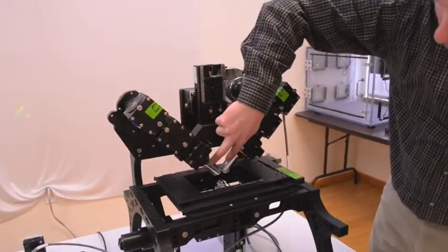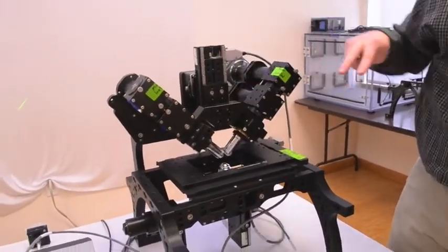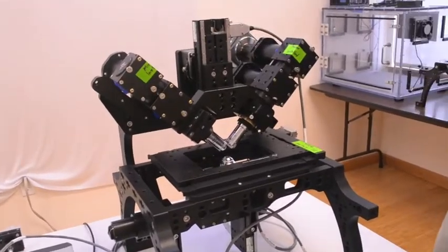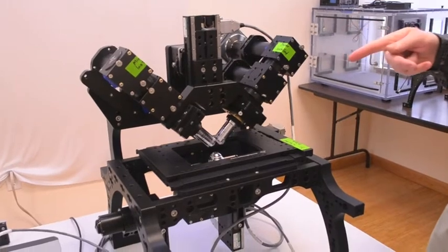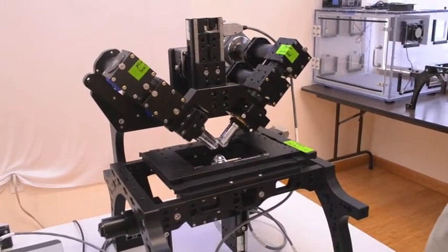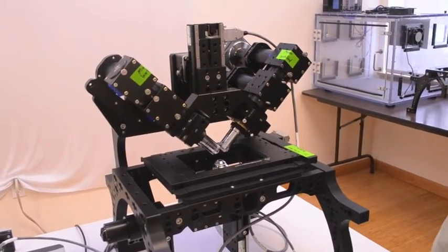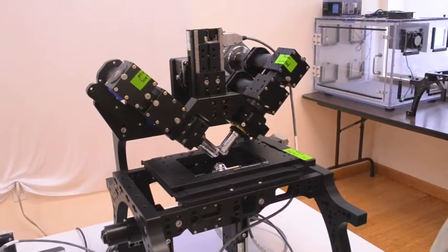And then there are two objectives, identical objectives. They need to be able to be co-focused. So we have customers using these 40x Nikon objectives or 10x objectives. Other objectives could be used as long as they can be co-focused.